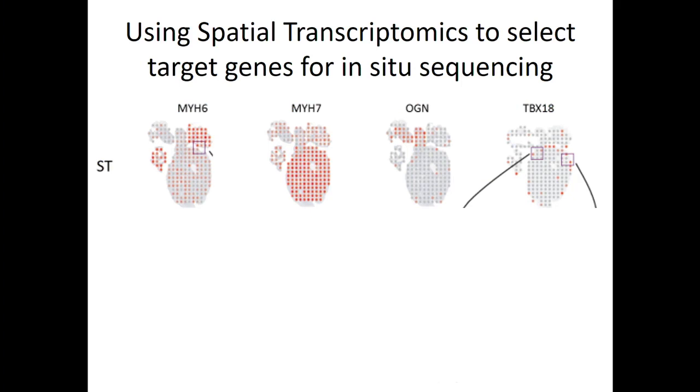And we have done an initial trial just to see whether we can go from spatial transcriptomic data to generate the targets for the in situ sequencing. So this is how spatial transcriptomic data looks. It's a method where you take a section of your tissue, put it onto a DNA microarray of spatially barcoded oligonucleotide primers, and blot over the RNA to the slide, and perform cDNA harvest and put it into a DNA sequencer. And then you get full transcriptome-wide mapping of the transcripts with a certain resolution.